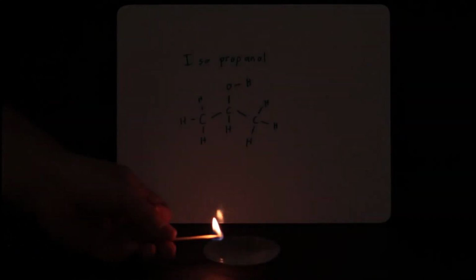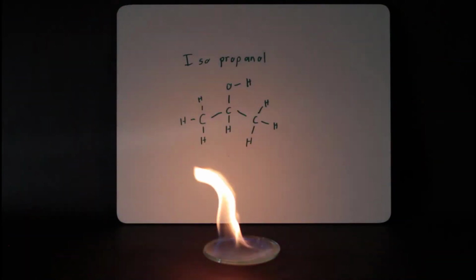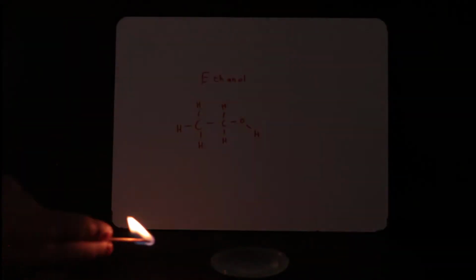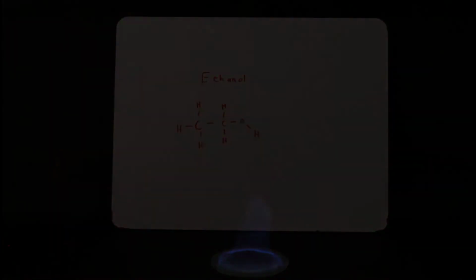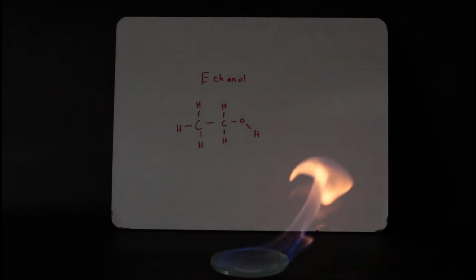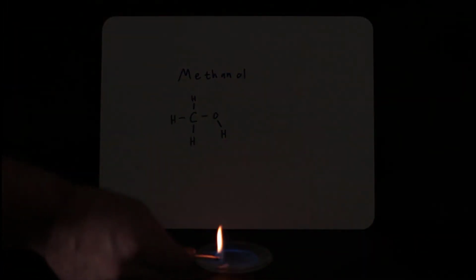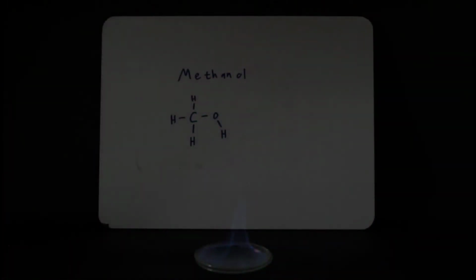An alcohol is a specific class of organic molecule with a hydrocarbon attached to a hydroxyl group. They are useful in a lot of applications, including as a combustible fuel. But each alcohol will burn at a different temperature. That's because they have different covalent bonds that are being broken as the substance combusts. That means they'll release different amounts of heat. In this lab, we will be predicting and measuring the enthalpy of combustion of an alcohol.